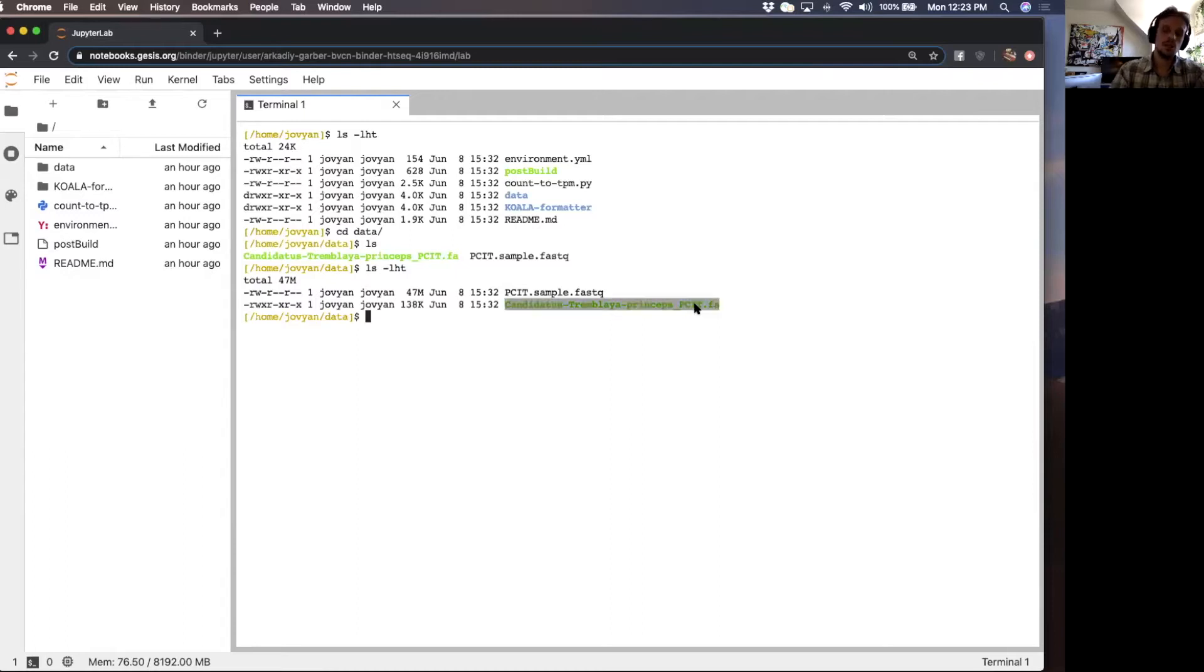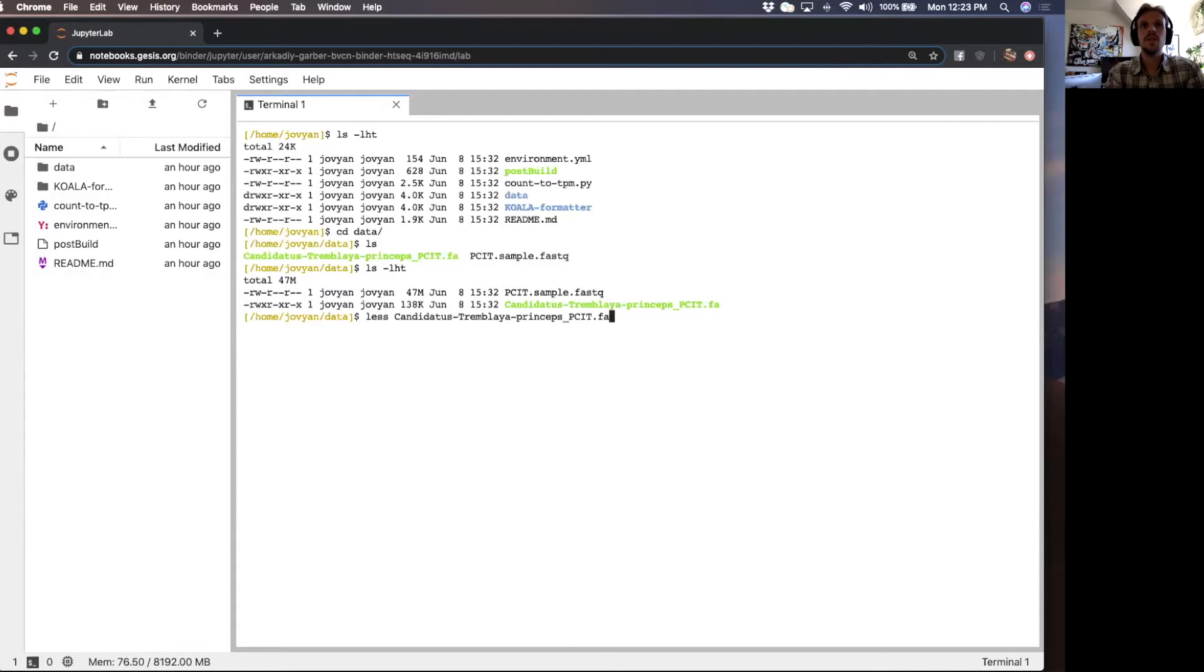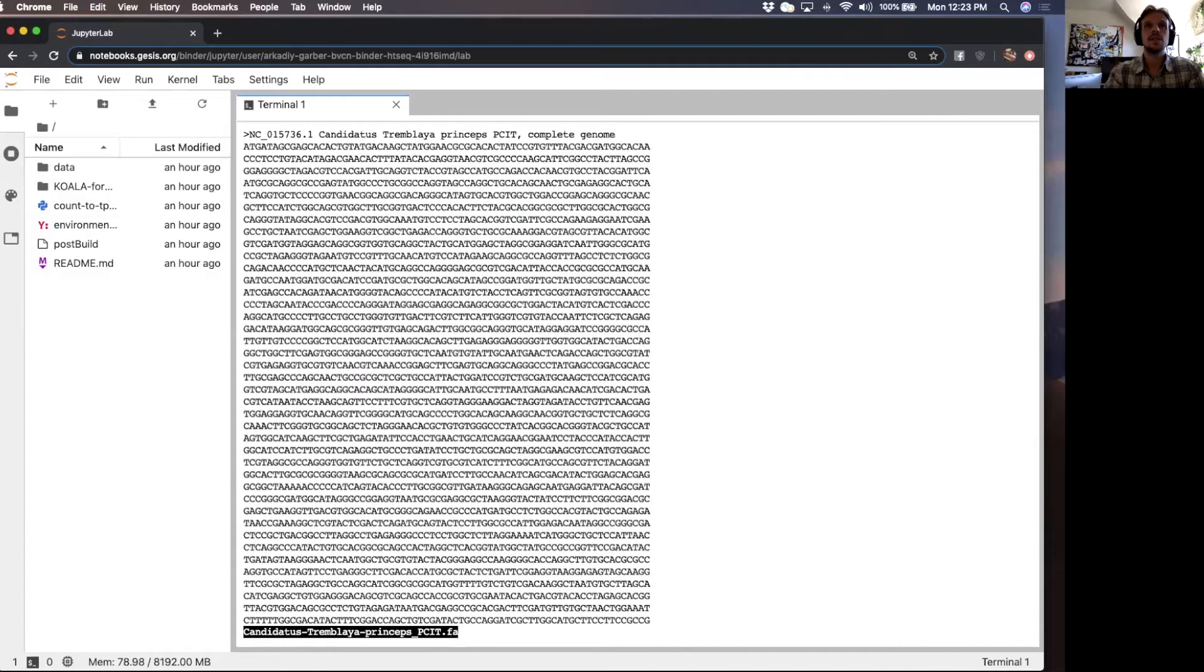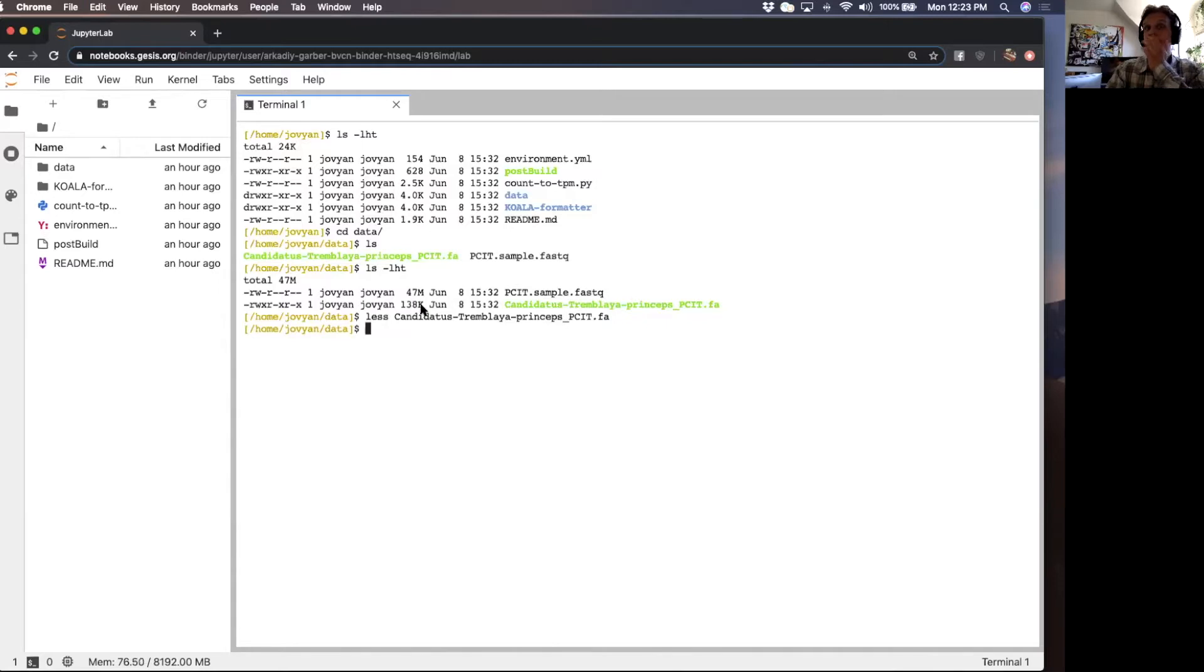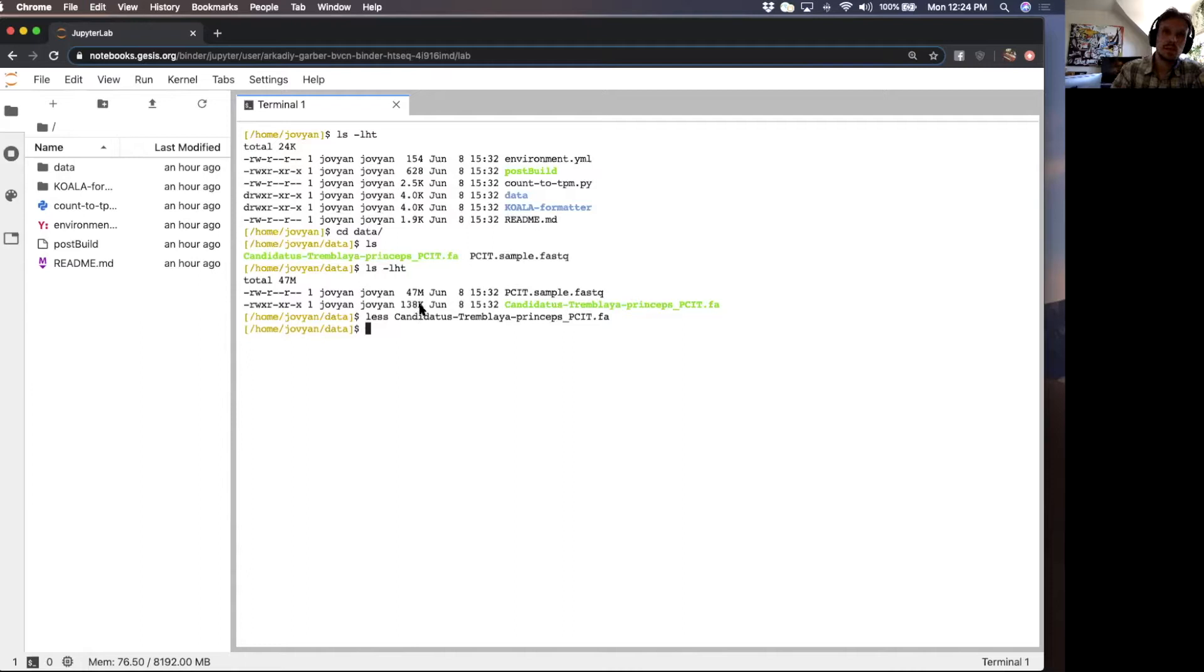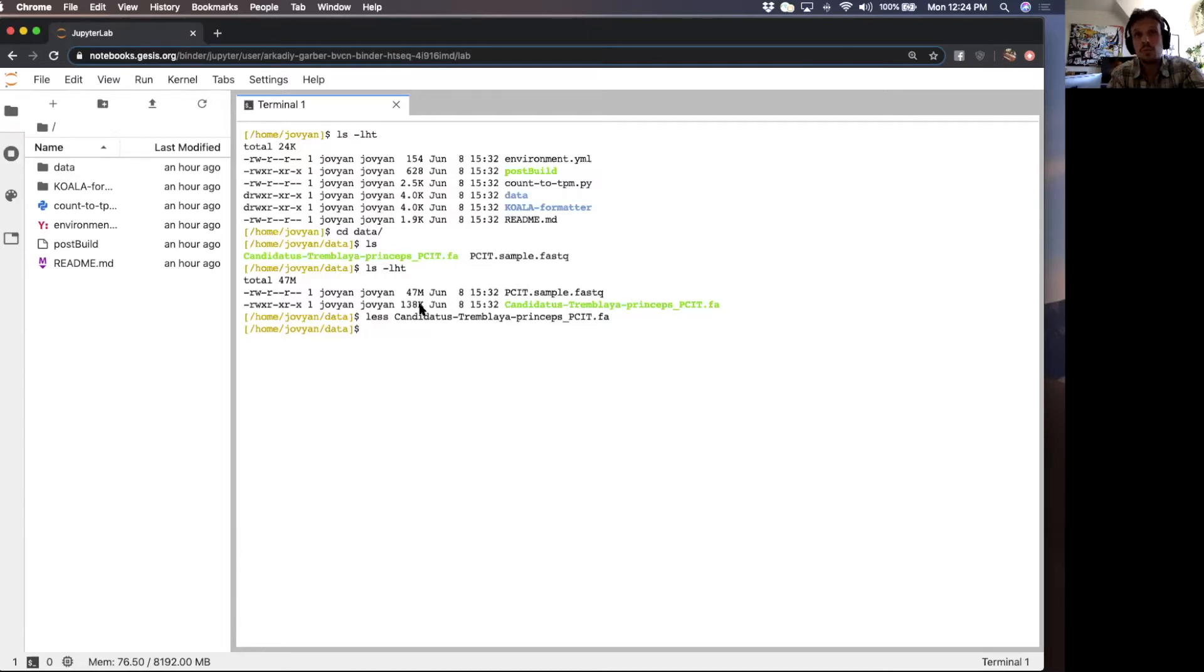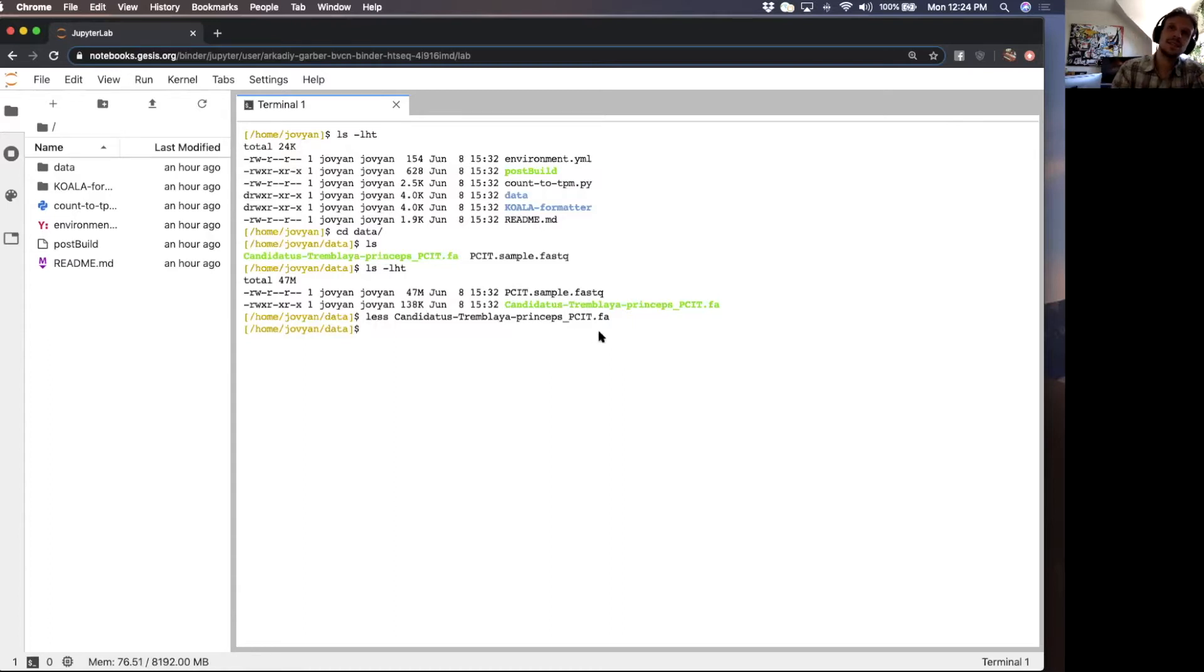This is a genome of an endosymbiotic bacteria. As you can see, it's a really small genome. It's only 138 kilobase pairs, which is tiny, given that most bacterial genomes are on the order of two, three, four megabase pairs. This is 0.14 megabase pairs. This is tiny.